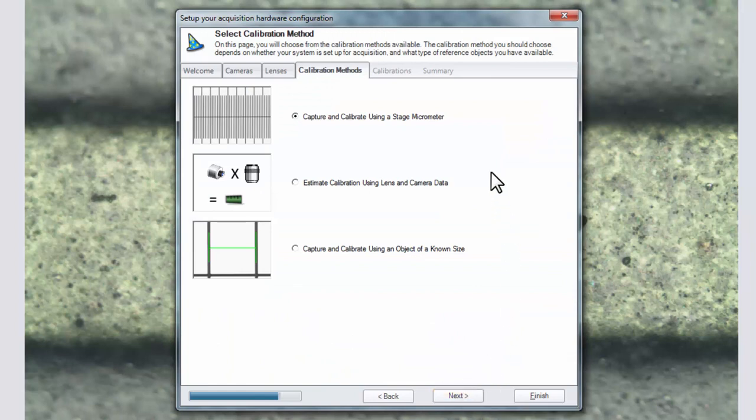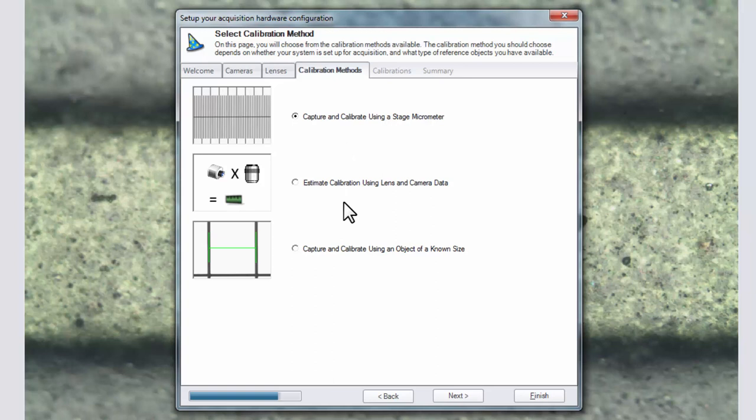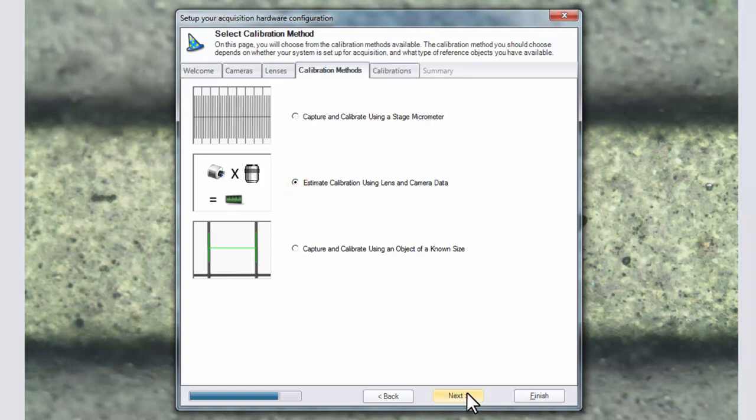At this stage you have three choices for calibrating your lenses. Choice one will auto calibrate an image of a stage micrometer slide on a microscope. Choice two will estimate the calibration using lenses and camera data. Choice three will calibrate by asking you to draw a measurement over an object of known size. We'll choose to estimate a calibration using lens and camera data and click next.